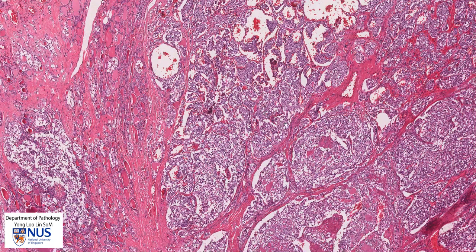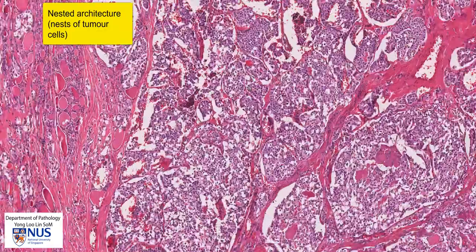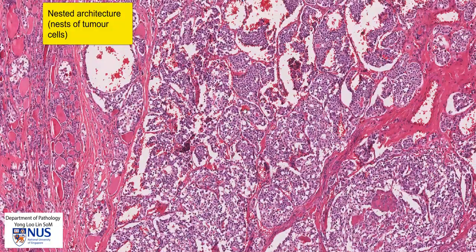The architecture of the tumor is forming nests, so we can see these solid nests of cells — rounded nests and sometimes larger sheets — and in between the nests there are a lot of small congested blood vessels.